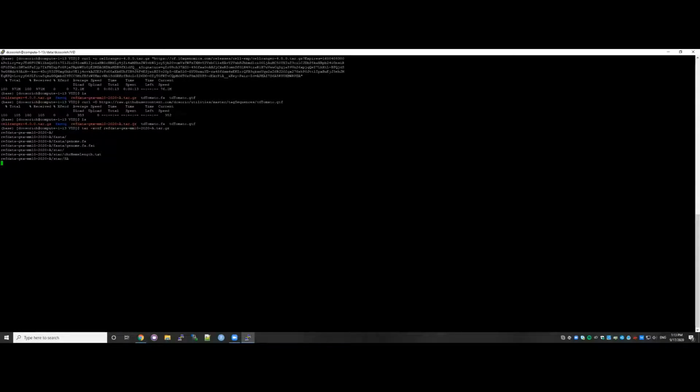Well, I use this reference because it's easy for me to get all the files and all the stuff. I just take what they provide to us and copy that in here. And move it to the text folder. Yes. I mean, so you can add another chromosome after you build the index or build the genome using that, right? No, I'm going to take the data they provide because they already have everything sorted and ready to use.